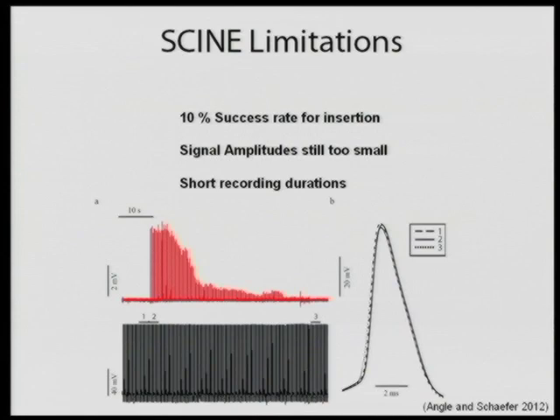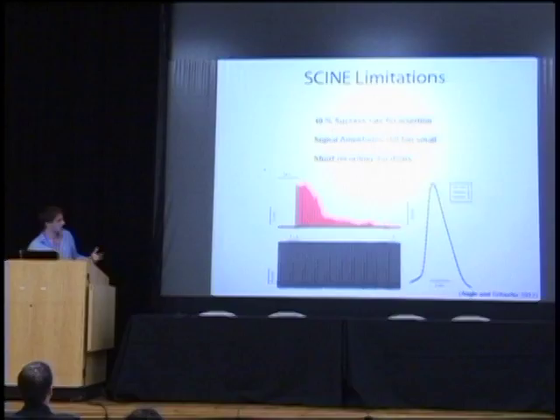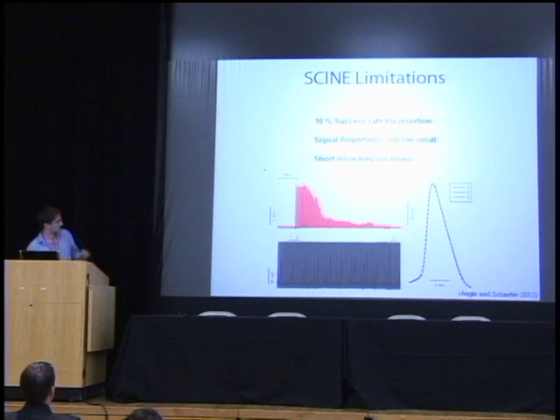The next thing is that the recordings are short. This isn't a long-term recording technology yet. And the reason for this is that the membrane seems to reseal. Even in the successful recordings, the membrane reseals around the probe, excluding the probe from the cytoplasm. So here you can see in the whole cell channel, the cell is firing action potentials. Here's an overlay on the right of action potentials from period 1, period 2, and period 3. Nothing changes in the whole cell recording, but if you look at the nanoelectrode recording, the amplitude of the action potential falls off on a timescale of tens of seconds. And we believe that this is due to membrane resealing around the probe.